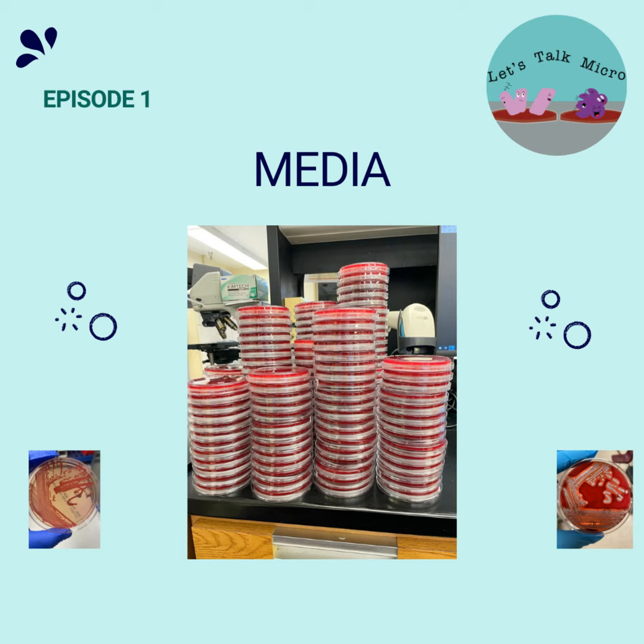And then you have your media, you have your sample, you have inoculated and streaked them, and they're ready to go to the incubator so they can start growing. Normally you take a look at them after 18 hours, but before you do that, you have to actually prepare a gram stain, right? This is the process of putting some of that sample on a slide and then using some staining techniques. You can look for white blood cells and organisms. But that's what we'll be talking about on our next podcast.